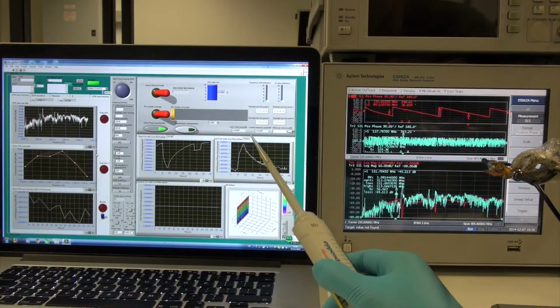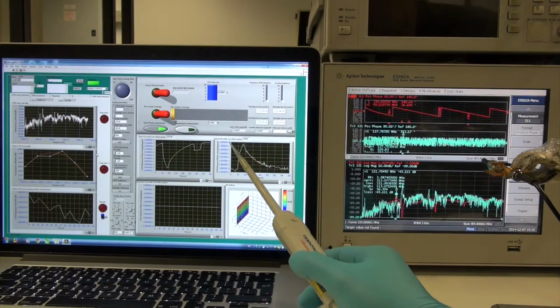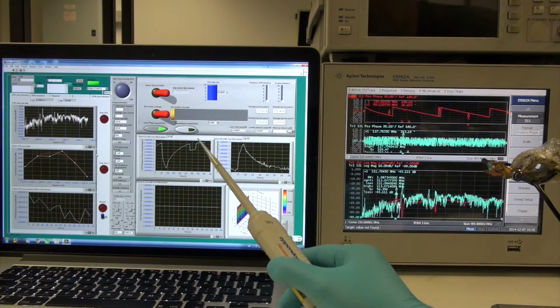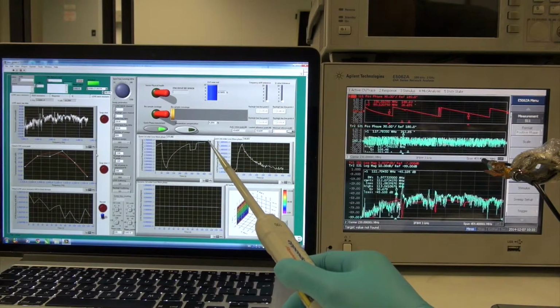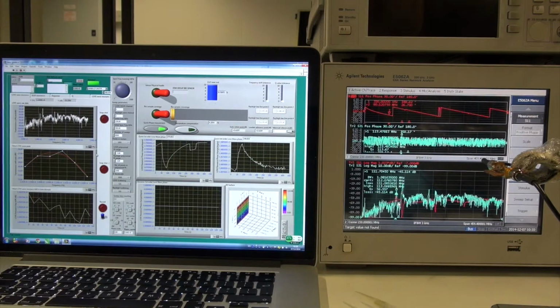So we will not repeat this process to save some time, but it's already proved. With our device, we don't need any temperature sensor, but we can separately detect the mass load change and the temperature change, which is very fundamental to high performance surface acoustic wave biosensors, which use the high piezoelectric coefficient substrate. So that's it. Thanks.